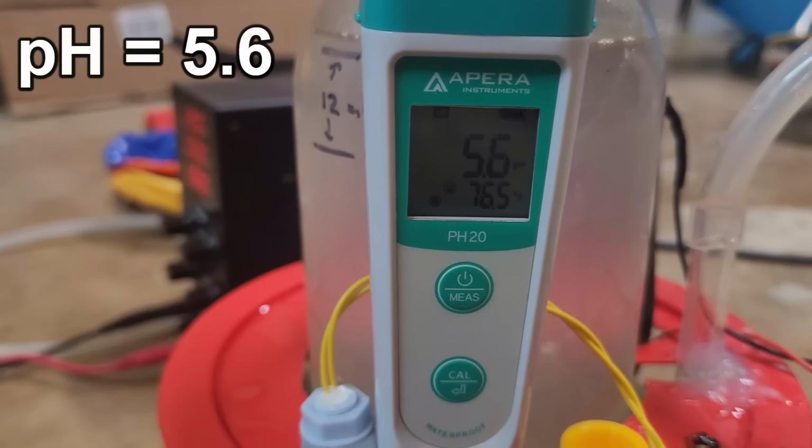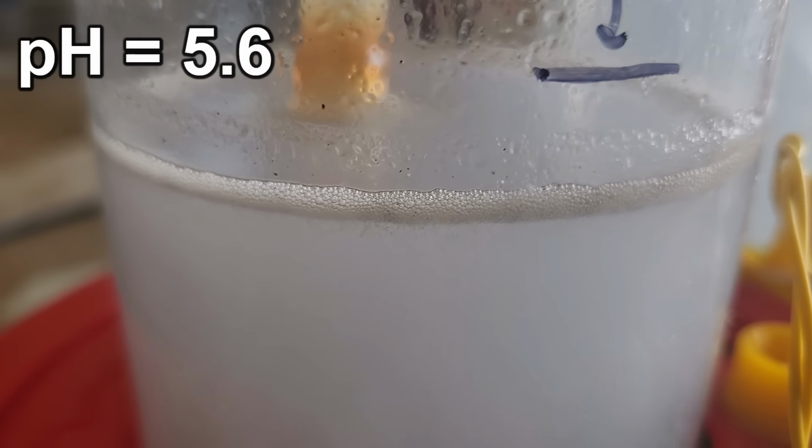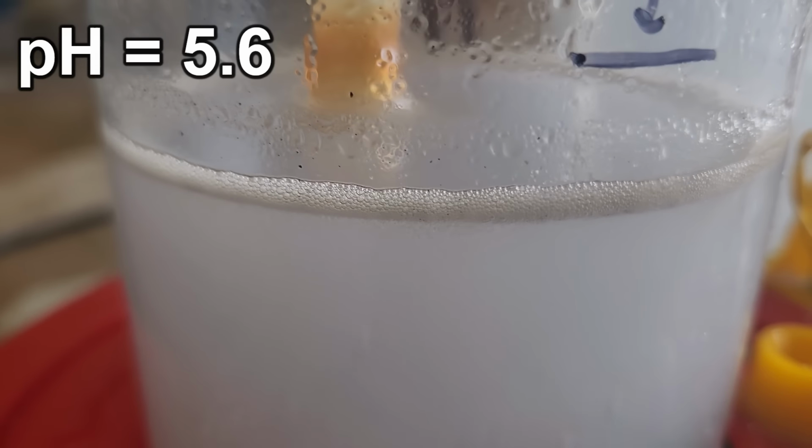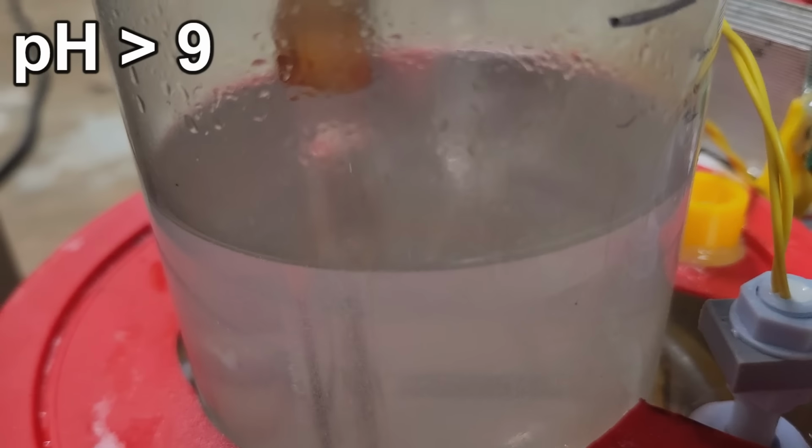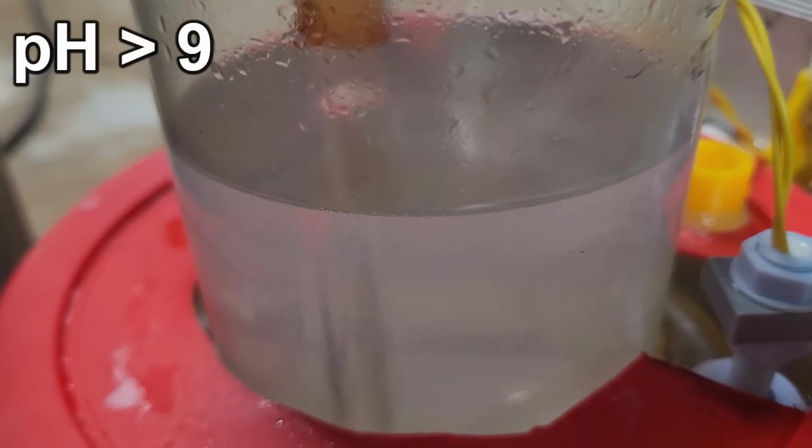Another telltale sign that we've got sodium acetate again is the reappearance of that weird oily layer on top of the water, which had disappeared after several days. Also, the smell of vinegar is pretty noticeable now, which it should be.